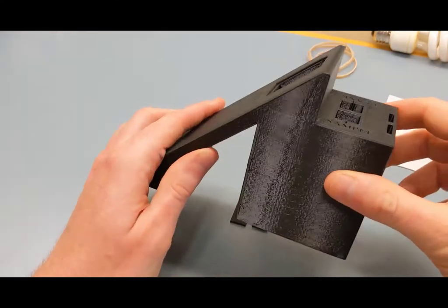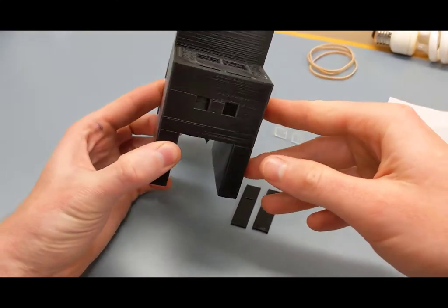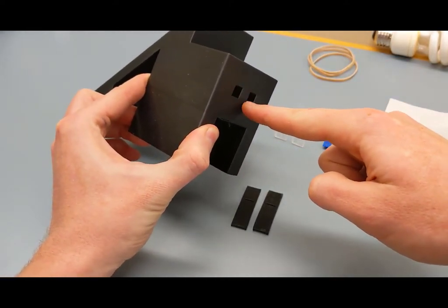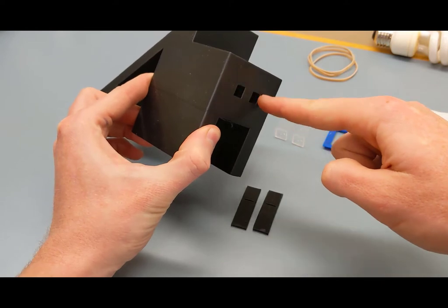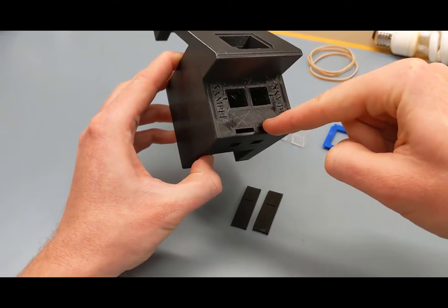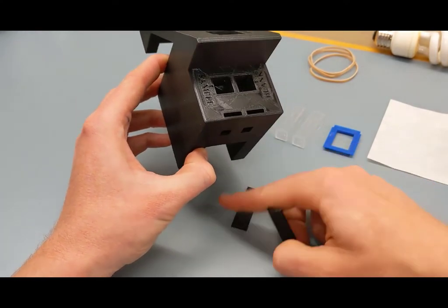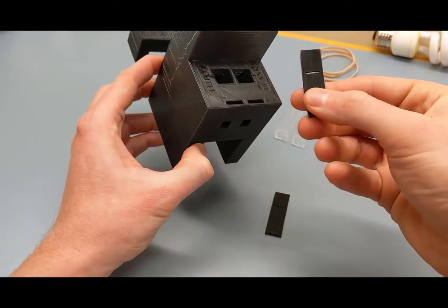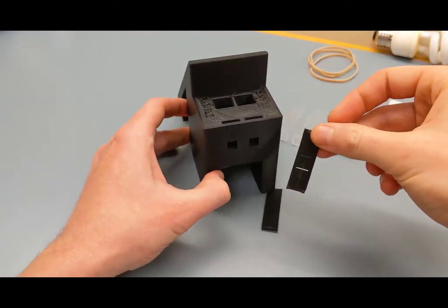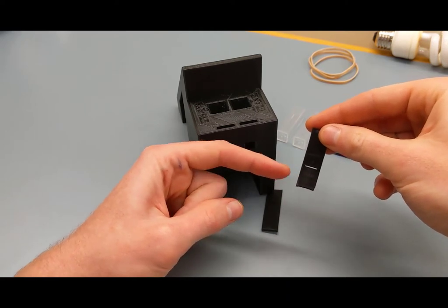Start with the spectrometer base and install the two slits. Light is going to pass into these two entrance apertures, and these two slots will accommodate the slits. Grab both of your slits and orient them — you can see they're slightly asymmetric, so orient them with the slit towards the bottom.